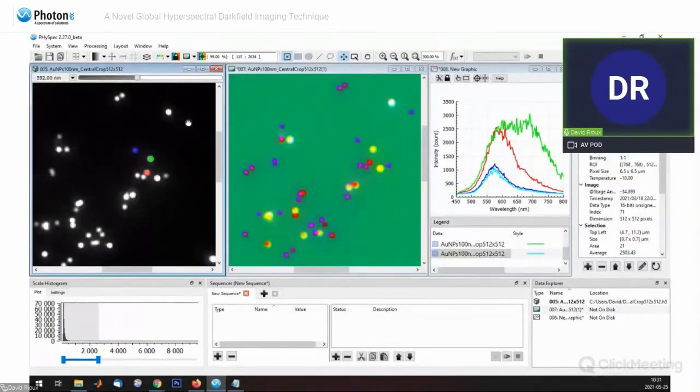And if I take that one here at the top and I put it on top of the white particle here, as you see, again, there is still a different spectrum. You see now we can find two peaks. It's a bit broader. So PCA really gives you information about what's similar and what's different in your sample. It can be really useful to detect the particles that are the same. And if you have different families of nanoparticles, it's easy to tell them apart.